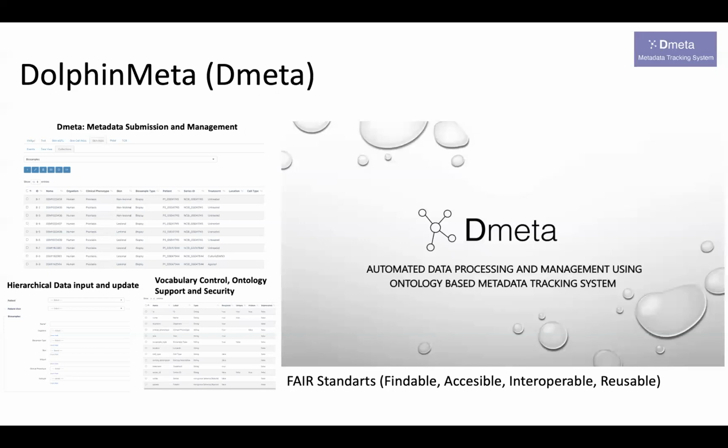You can define the status of the data that you want to use in the future. This is crucial because when you want to do, for example, single cell RNA-seq, you need all that metadata, for example, whether it's vitiligo or some other disease, whether it's a lesional site or a non-lesional site. All this data needs to be integrated with the analysis. If you don't put that information somewhere, the bioinformatician you want to work with will have no idea what your data is. But when you put everything here, everybody's job will be easier, and you're going to track down what's going on with your data. And then you can share everything in the standards.